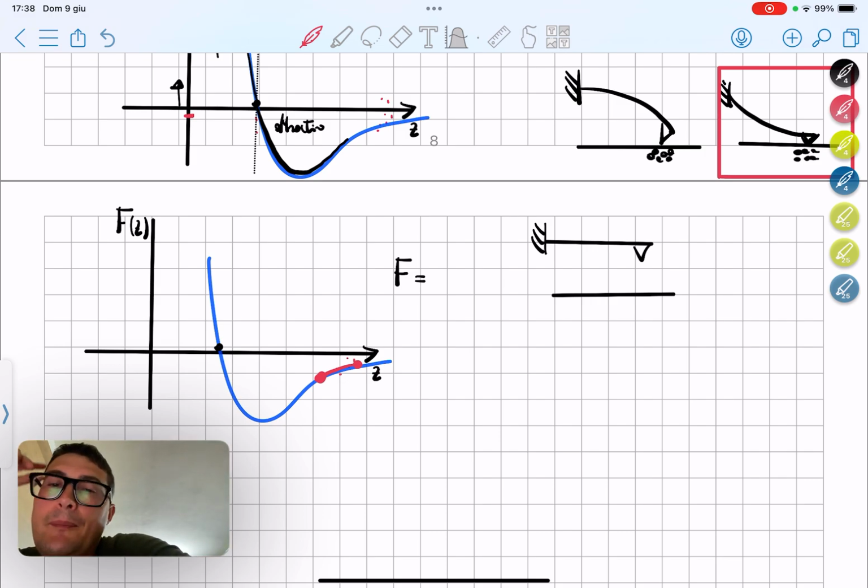But if the cantilever is getting closer, is deflecting toward the sample, as we said, it's in a static, equilibrium condition, because the attractive forces caused by the sample tip interaction are counterbalanced by the spring coefficient of the cantilever itself. So it's kind of an equilibrium as we approach it.